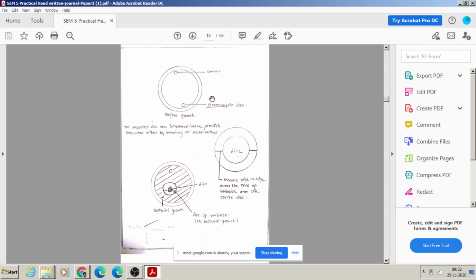An antimicrobial compound, for example the antibiotic streptomycin, is used as a control. Say, for example, you want to check the activity of streptomycin against a particular fungus or bacterium. The streptomycin solution has to be prepared, and the paper discs have to be dipped in it. So we dip the disc in a solution with a known concentration of the antimicrobial compound, and this disc is then put on the previously inoculated petri plate.